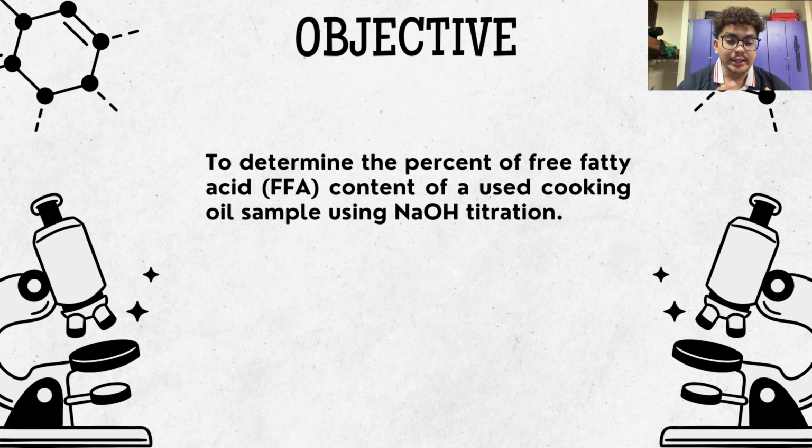Now, for the objective, it is very simple, which is to determine the percent of free fatty acid, FFA, content of a used cooking oil sample using NaOH titration.